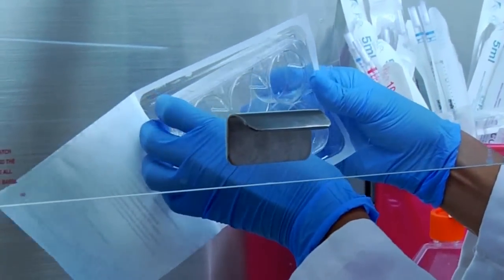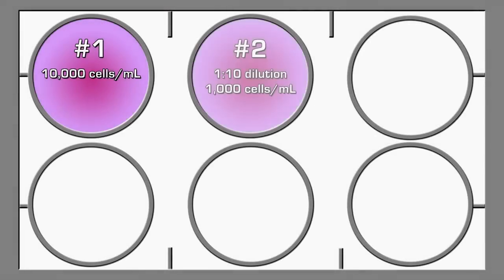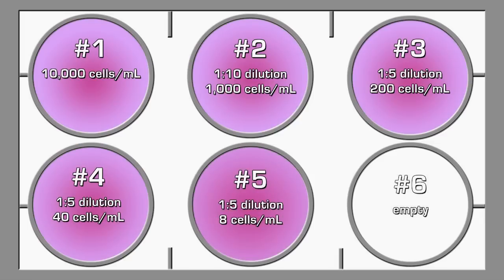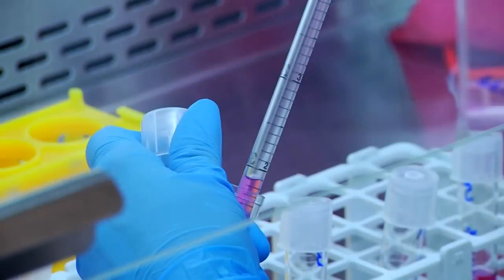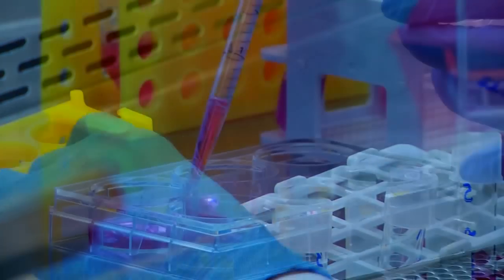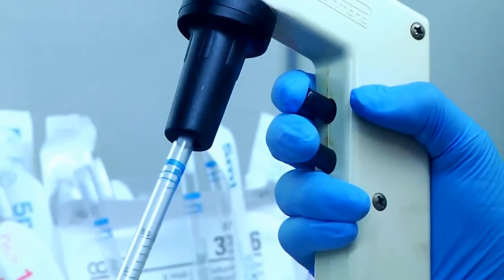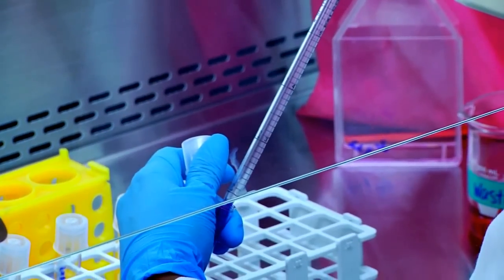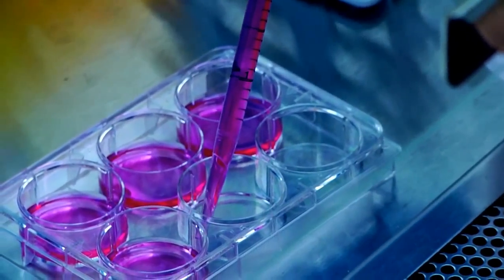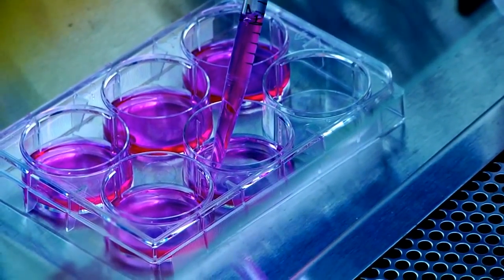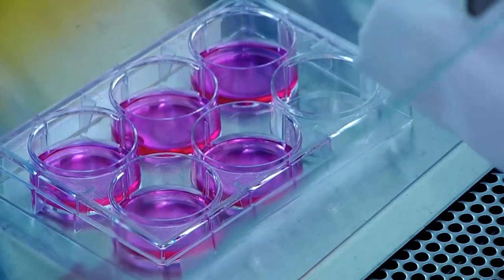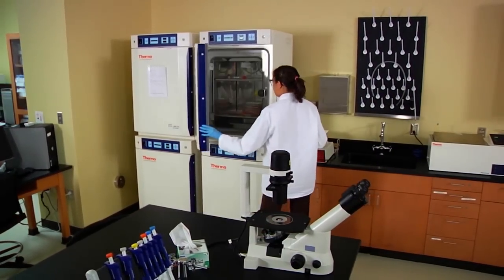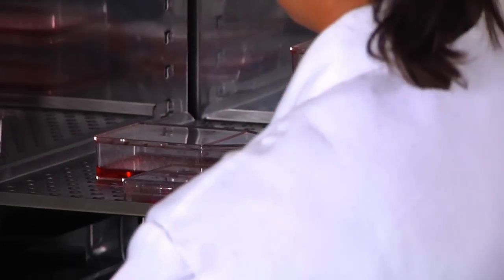Now we're ready to seed the 6-well plate. Transfer 2 milliliters from each tube to its corresponding well. Since we have 5 tubes, we'll only be using 5 of the 6 wells. Place the 6-well plate in the incubator and allow 1 to 3 weeks for colonies to form.